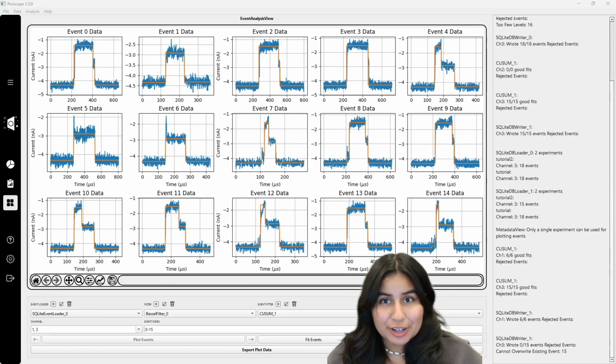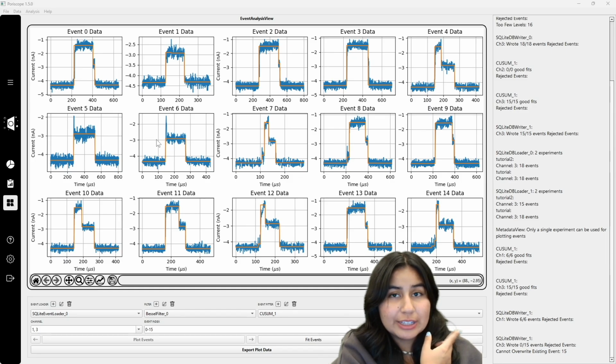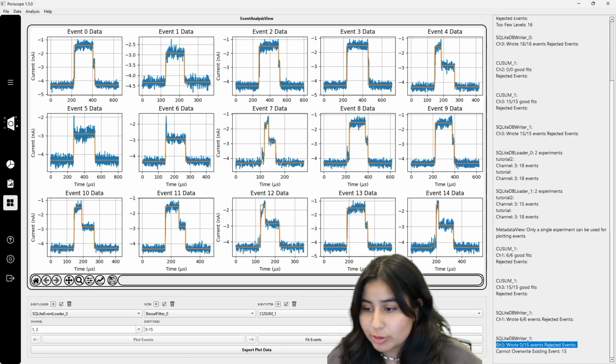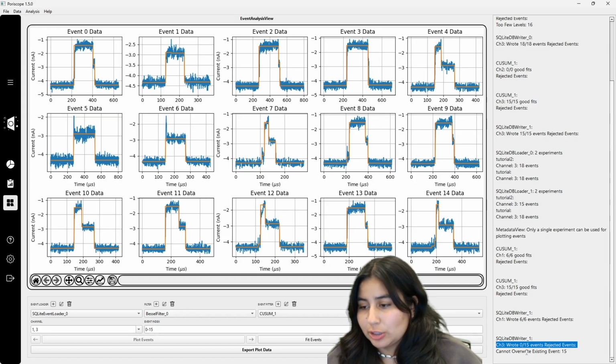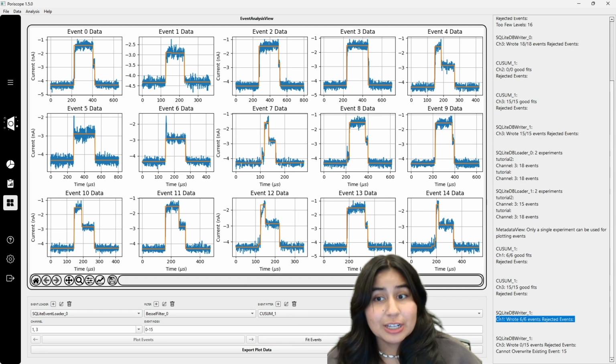So let's get started where we left off. I actually went back to this last step from the previous video and I added an extra channel to the database. You can see it right here. DB Writer 1, I wrote 6 out of 6 events of channel 1. I wrote channel 3 as well, but it was already there, which is what we did together. So that did not get overwritten, of course. But yeah, I just wanted to mention that I added channel 1. You could have done that too. Here, you select channel 1, you feed it, and then you write it. So just wanted to mention that.